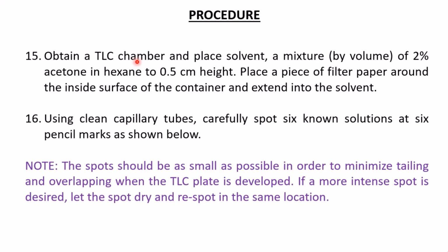chamber. You add your solvents. In this case, you're going to use 2% acetone in hexane. So you realize that this time around we are using a mixture of solvent. We are using a non-polar solvent together with a polar solvent, right, to do our elution.